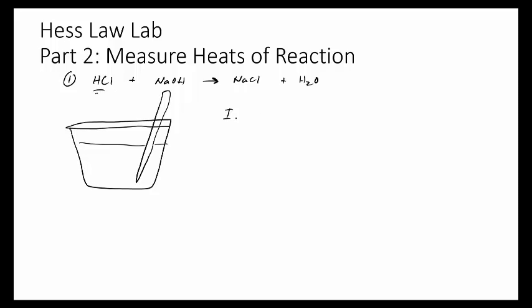So actually, these are the part of the reaction, and this is going to give off some heat. So this is a plus heat. Okay, and we want to capture this number here, and I'll use red to color code what we're doing. So the heat of solution equals the mass of the solution times the heat capacity of the solution times delta T of the solution.